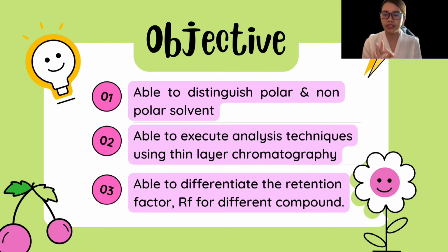Three objectives in this experiment. The first one is to be able to distinguish polar and non-polar solvent. The second is to be able to execute analysis technique using thin layer chromatography. And the last one is to be able to differentiate the retention factor RF for different compounds.